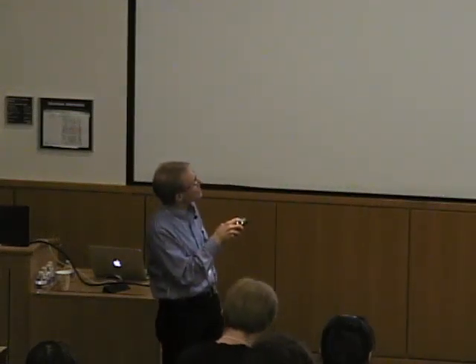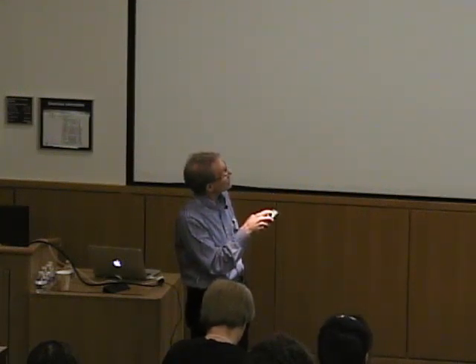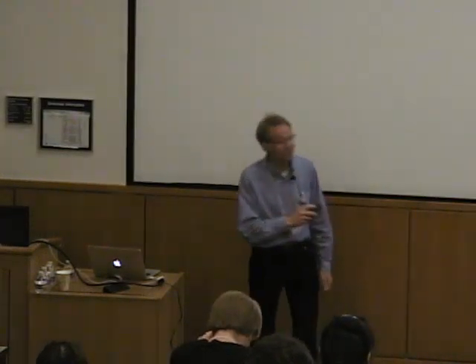This is the technique that the students are learning in the tutorial session. I'd like to review some of the issues about the method, just remind everyone what you can do with the method, some of the issues, red flags, sources of error, that type of thing. I want to focus a little bit, in terms of the bioinorganic applications, on this idea about the metal buffer interaction. This turns out to be a big deal in this technique. And finally, we have a more limited set of examples that will show you how you can use this method to learn some molecular insight.